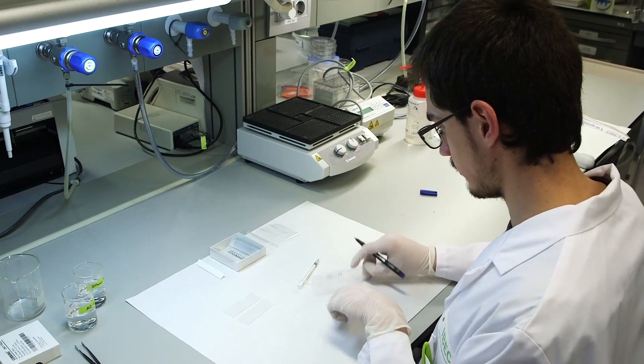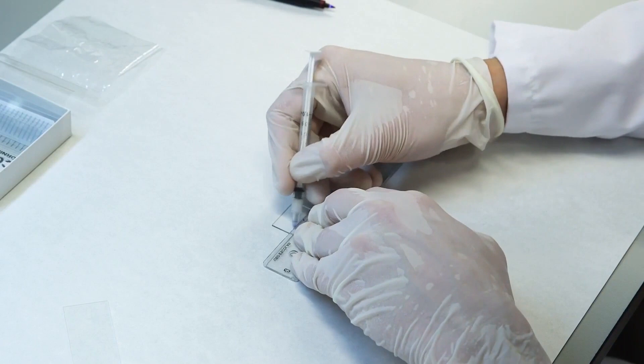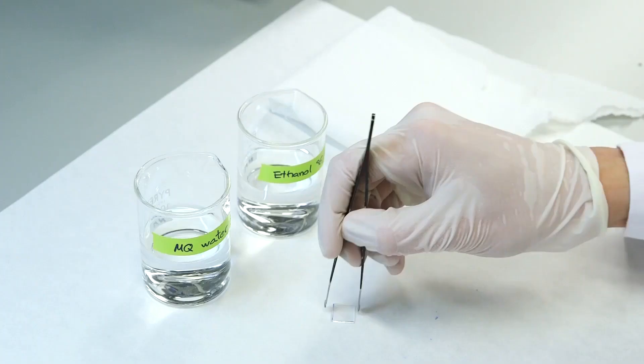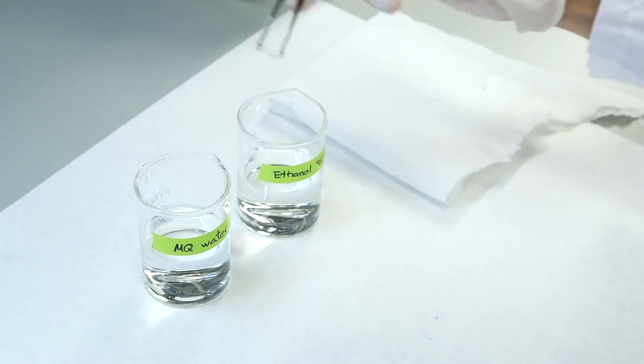The first step is to prepare the working substrates. Customized square glass slides are produced by cutting microscopy slides with a diamond tip cutter, making slides of 1.25 x 1.25 cm in size. Wash the slides with deionized water, followed by 96% ethanol, and let them air dry.